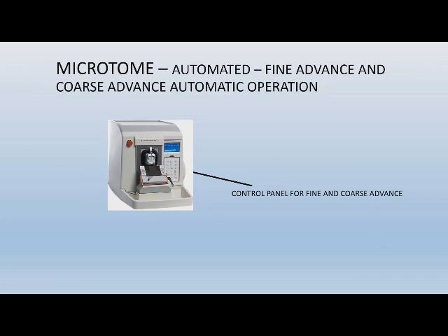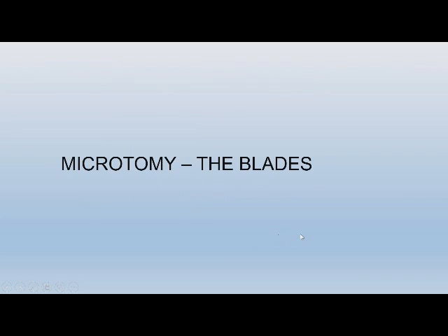So you don't have to worry about rolling your coarse feed wheel back. You just push a button and whiz, it goes right back to your home position, and you're ready to start with a new block. Plus all of the little XYZ controls they have, so the recuts are made so much simpler. But anyway, we'll move on.